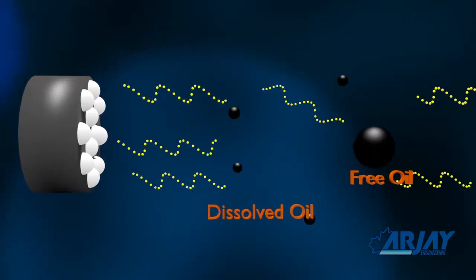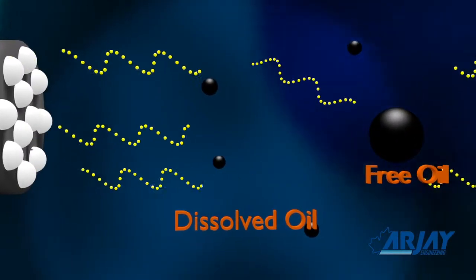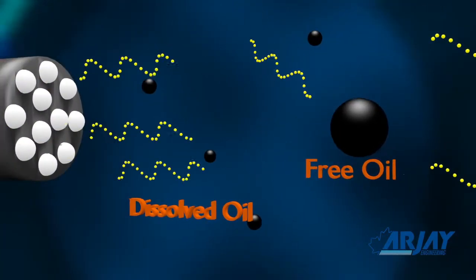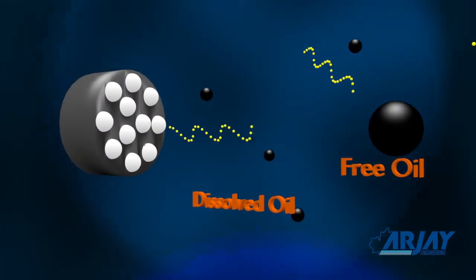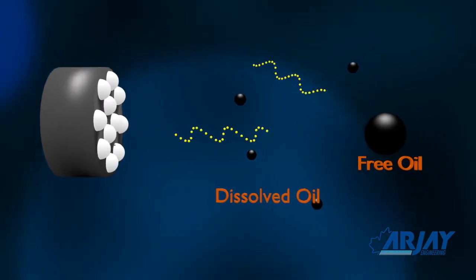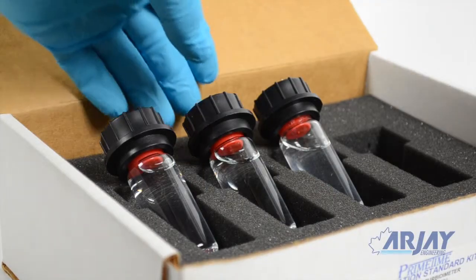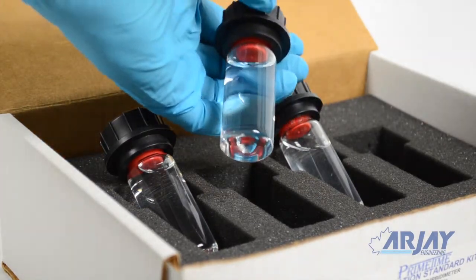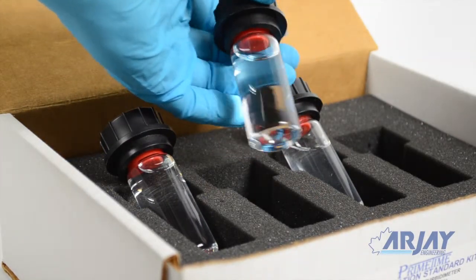The 3420 uses a light scatter approach to measure all free oil types. Since different oil types will provide different optical responses, a site calibration is done to achieve optimal accuracy. However, the unit is factory calibrated for out-of-the-box operation, and correlation calibrations can be made using a turbidity formazine solution.